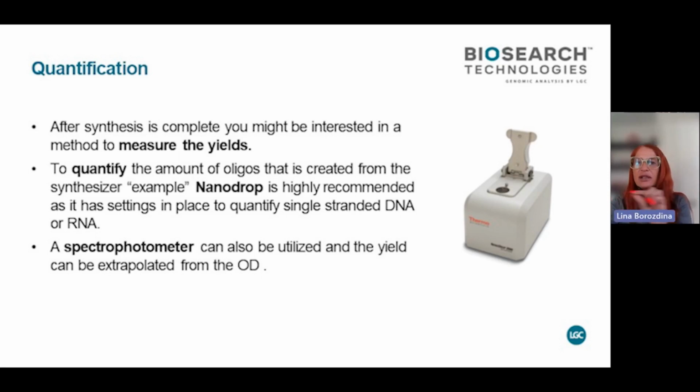So after you quantify, you know, okay, I have that many micromoles, nanograms, milligrams, ODs in my solution from one column of synthesis. What you do after that, you want to either purify it, analyze it, or just go ahead, precipitate it, and use it, especially for the primers. Just do a quick dissolve step.